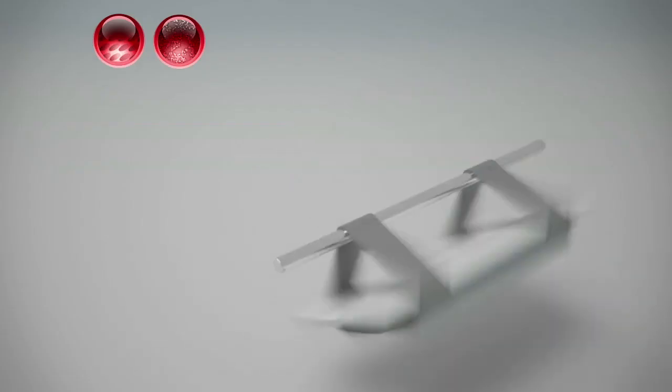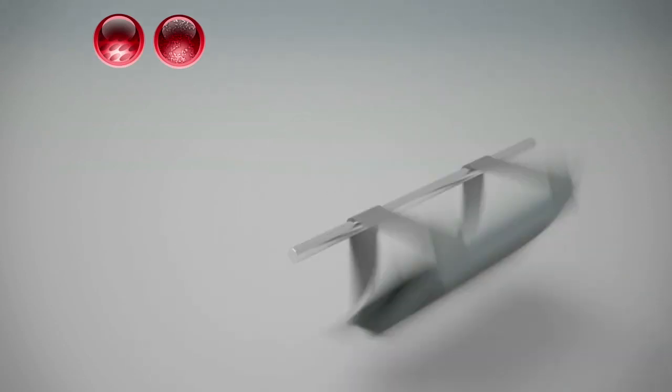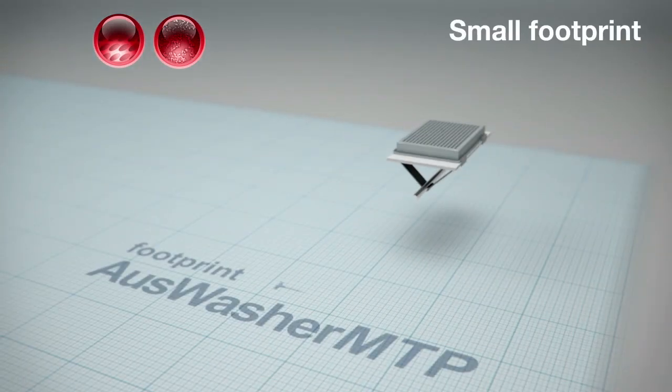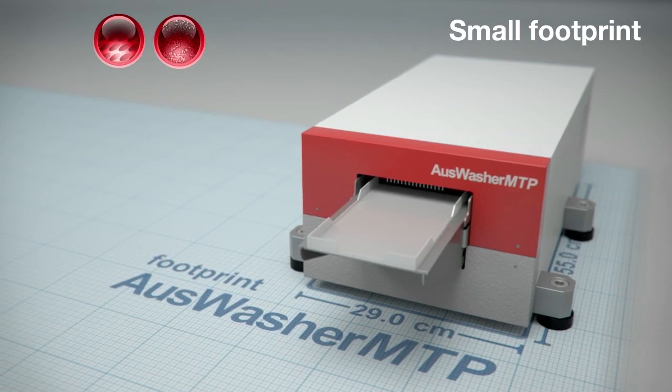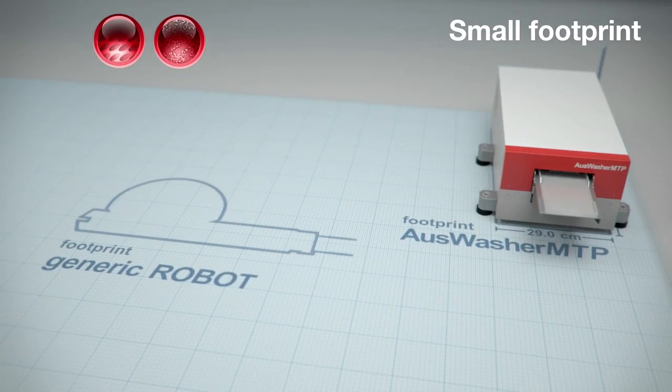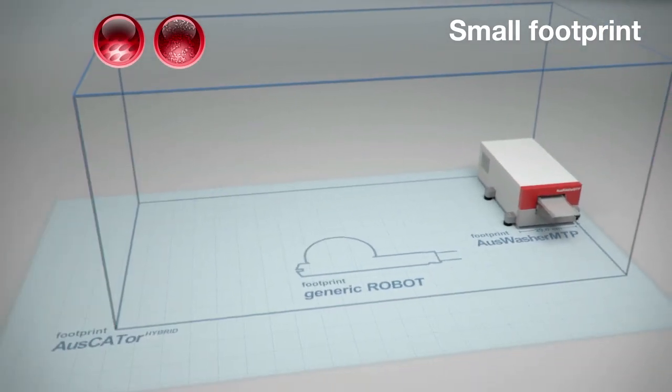The low RPM gentle dry mode leaves structures undisturbed or leaves a protective liquid film on protein arrays, yet efficiently removes culture medium and wash buffers. All in an automation-friendly footprint and interface.